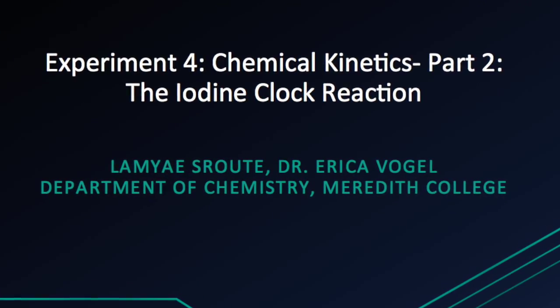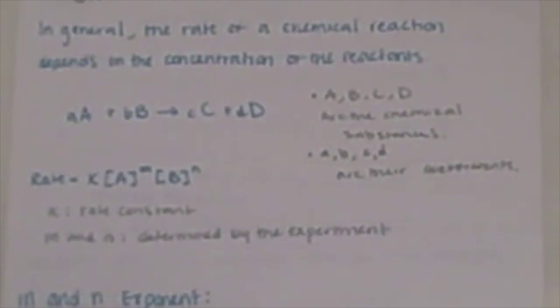This is for the second part of experiment 4. After you've prepared your solution, you're now coming back and you're going to be using it in this part of the lab. So the second part is all about chemical kinetics.